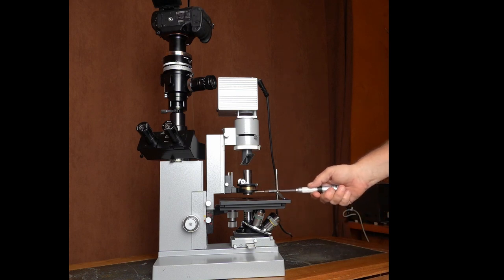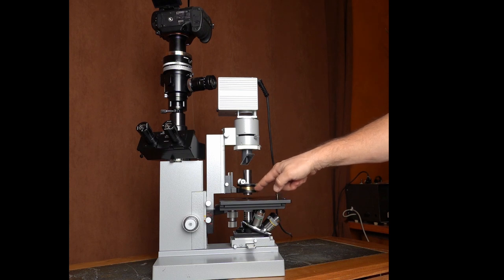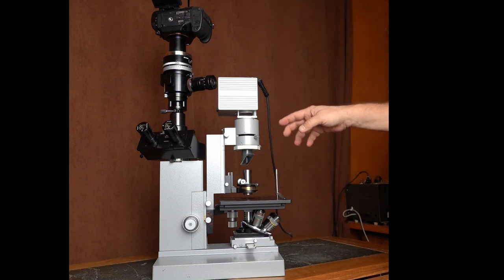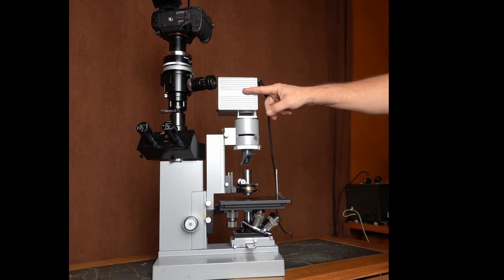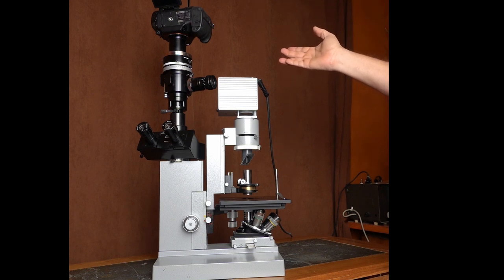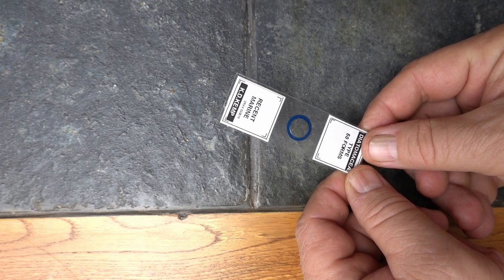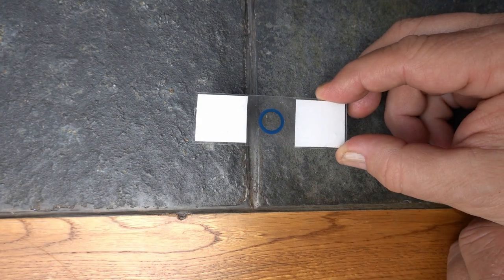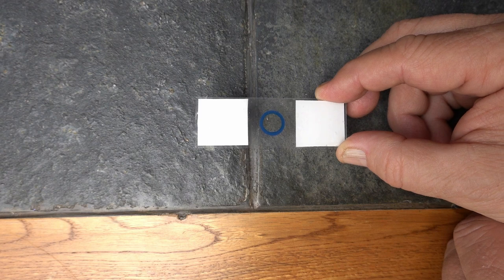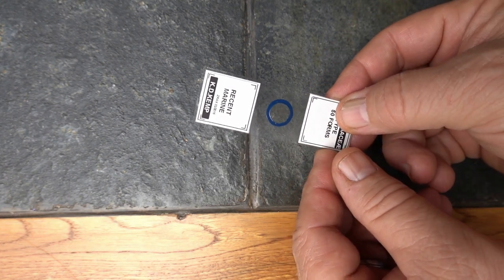Normally inverted microscopes are set up with long working distance objectives, which have a much longer working distance from the objective to the specimen. That allows you to put petri dishes with cultures in them, combined with a low NA condenser. This setup differs, with a 50-watt light box — there are 100-watt ones available but 50 works fine — and this Heine condenser which can go all the way up to a numerical aperture of 1.4.